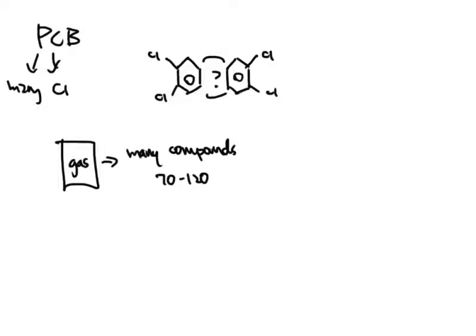Well, the GC can separate these, and the GC does a very good job in doing it as long as you make the proper settings. So the GC will, one by one, separate these things out, and it will begin to analyze them. So one component comes out, and it gets analyzed, and then we report that data, and then a second component comes out, and we begin to analyze that one. And then a third component will come out, and the GC will analyze that one. And it will do that for everything that's inside of the system or the sample itself.